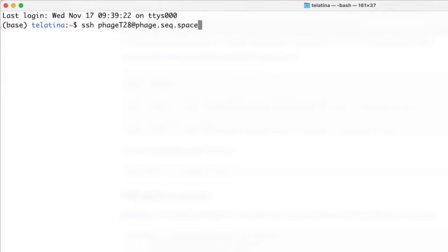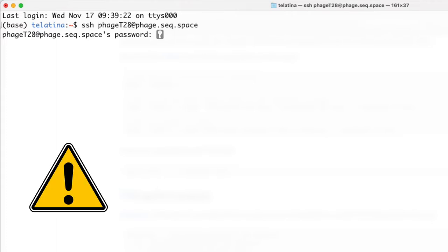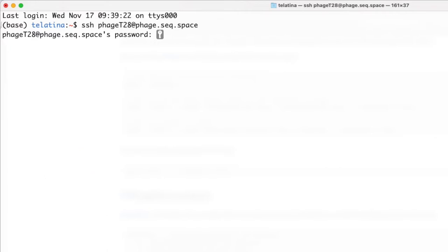If it's the first time you log in, after you hit enter you will get a warning and you will need to type 'yes' to proceed — this is absolutely normal as long as it's the first time. Then you have the password prompt, and it's very important to remember that we will not see any feedback: no dots or asterisks while we type.